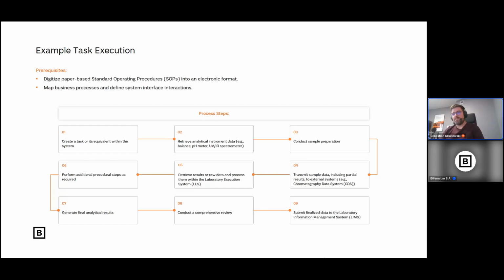The second way is some kind of a smart approach, because you have your LIMS method names, and you have your LES system results. Maybe there is a way to link them somehow. In the end, you also end up with a mapping table, but this one can be done, let's say, on the fly by some kind of automatization software.